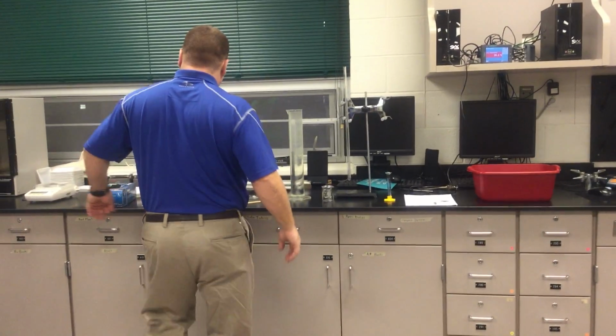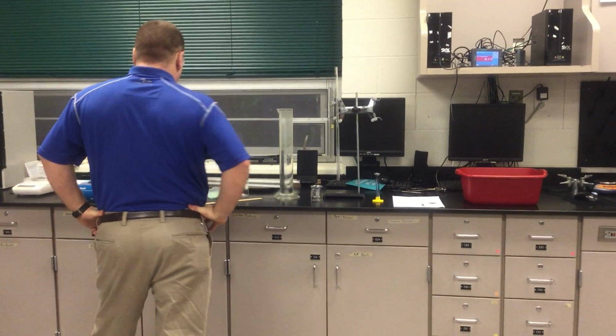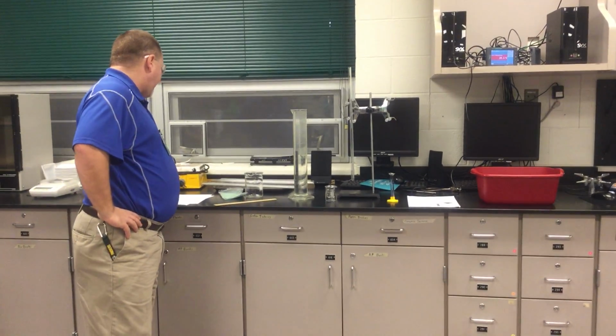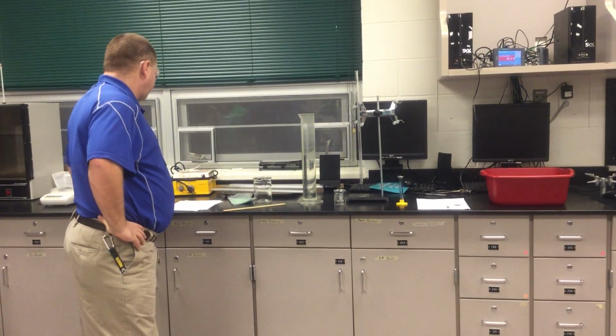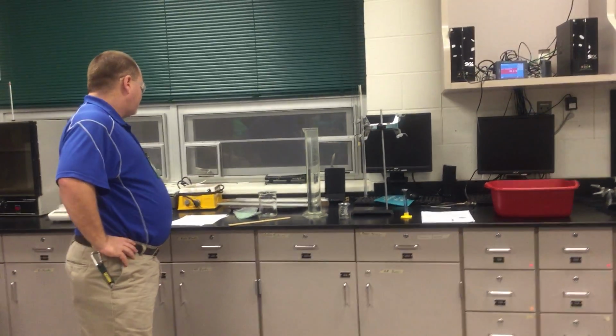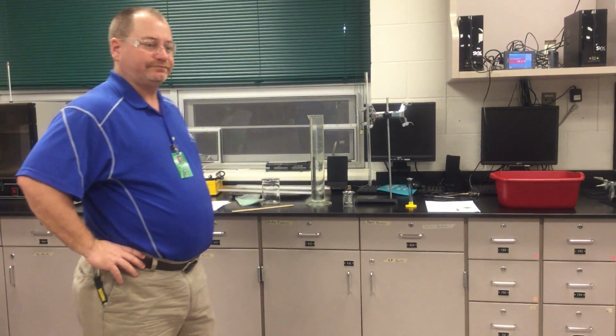to the page where it says ambient pressure. It should be S7 down at the bottom. Okay, it has a data table on it. Okay, what I want you to put in your data table for trial 1 is the following: for ambient pressure, 29.17 inches.